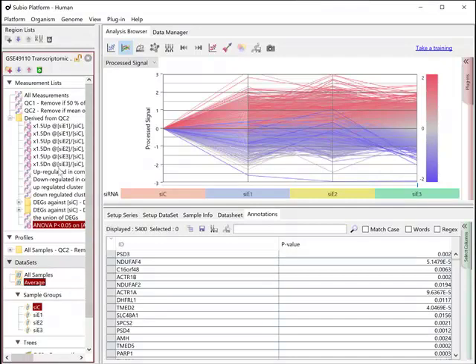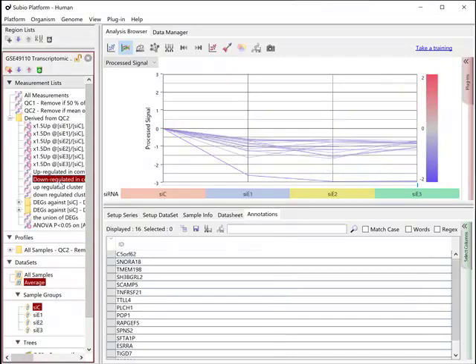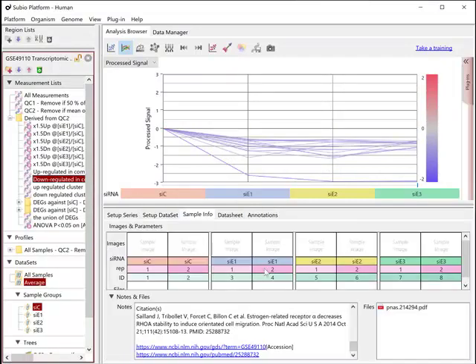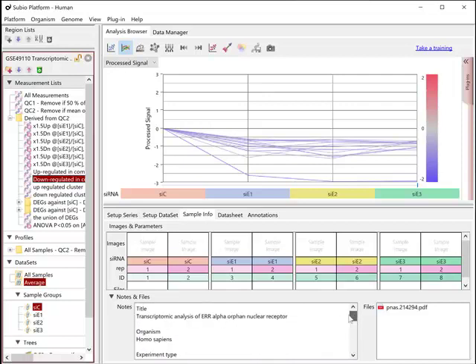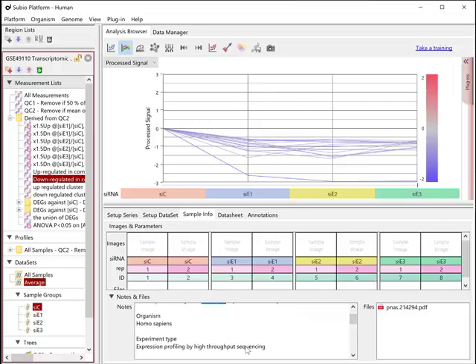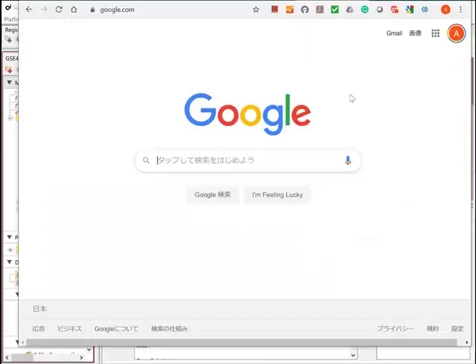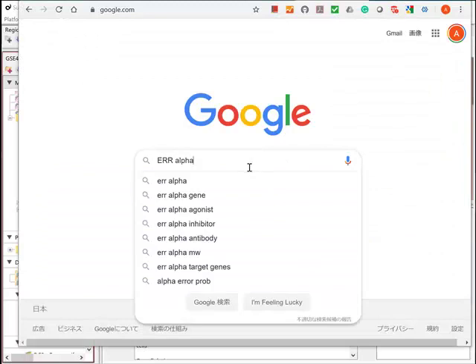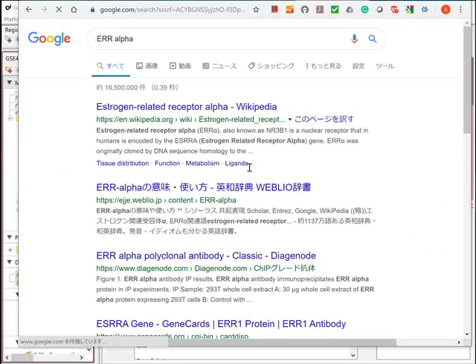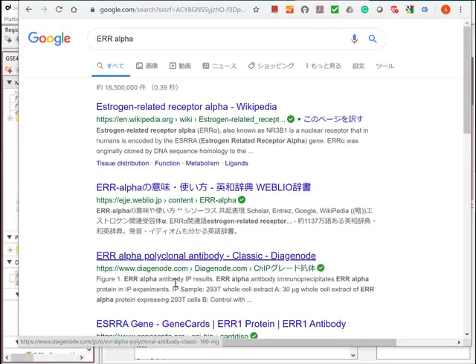Do you remember that you took a note about this study in the sample info tab? This experiment inactivated ERR Alpha with CERNA. If you Google it, you find the name of the gene as ESRRA.